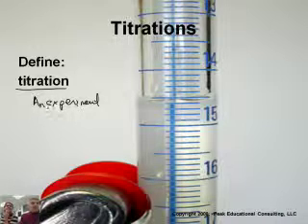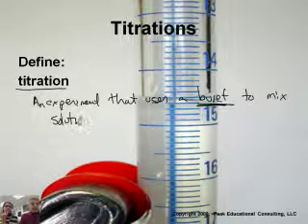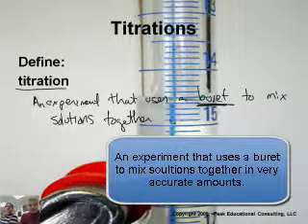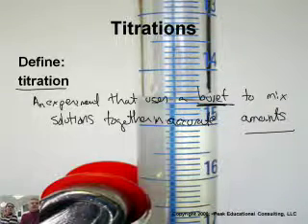an experiment that uses a burette. And we'll show you what one of those is here in just a minute. This is actually a burette in the background. It's kind of hard to see in the big scheme of things. That uses a burette to mix solutions. And solutions was unit 9, right? So that mixes solutions together in very accurate amounts. And then you can really learn lots of things. Okay, so that's what a titration is. And we'll demonstrate start to finish how one of these works. You're going to do so many titrations, you're going to be sick of them. You're going to be a pro.